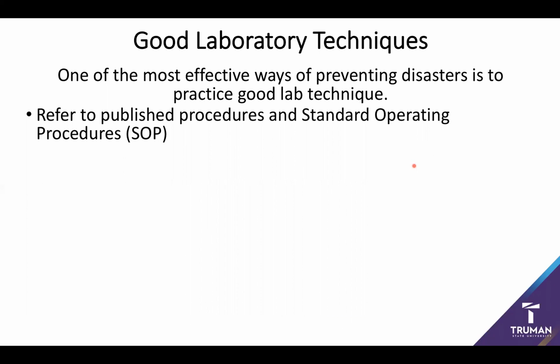So a lot of these are going to be published in journals, but there are also a fair number of websites developing that spread standard operating procedures that can be trusted and help minimize any sort of danger. And one of the reasons why this big move started was such incidents that I've been talking about over the last several weeks, including the Texas Tech explosion and the Sangji incident of setting herself on fire, because almost all of these incidents started with somebody who wasn't following SOP.